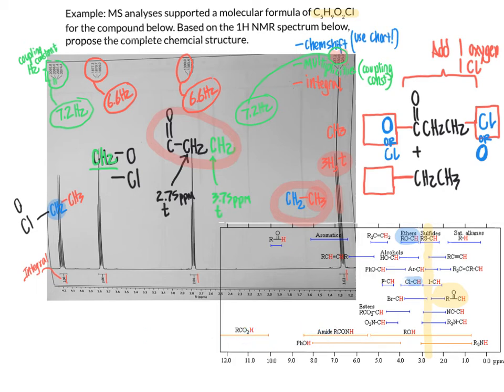And that's one of the things that's really frustrating and really exciting as well about solving NMRs. It's like solving a puzzle where you can be really frustrated about it and you can be like, this is never going to work. I'm never going to be able to solve this. And then eventually when you solve the puzzle, that part is super gratifying. So just be patient with it and be willing to try different things, sketch out different things, and use lots and lots of scratch paper, to be honest.